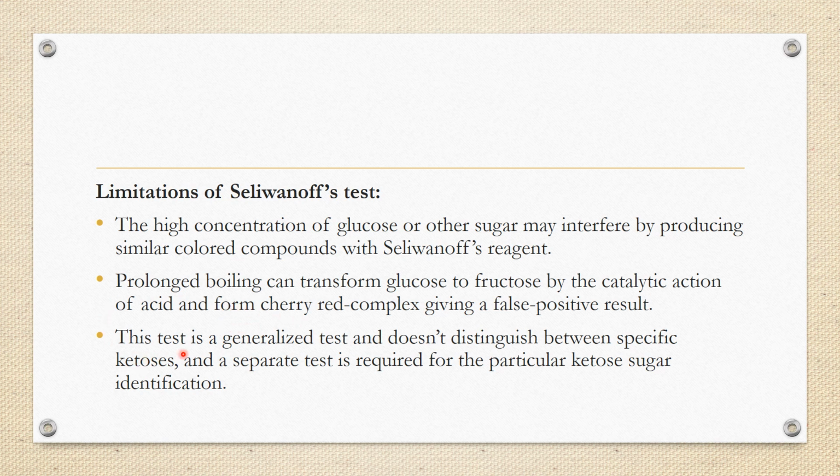This test is a generalized test and does not distinguish between specific ketoses. It just indicates the presence or the absence of ketose in the given sample, but does not distinguish between the specific ketoses. A separate test is required for the particular ketose sugar identification.